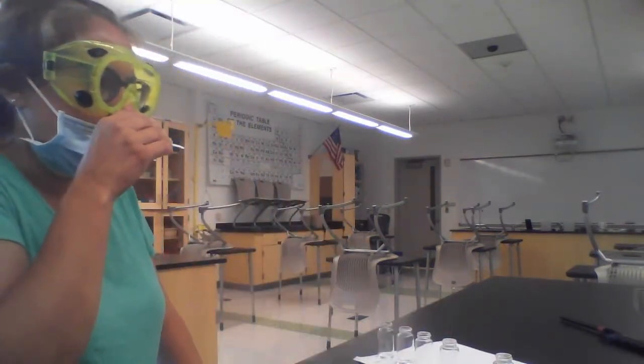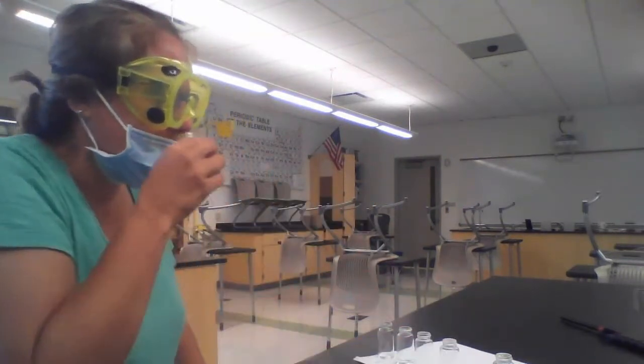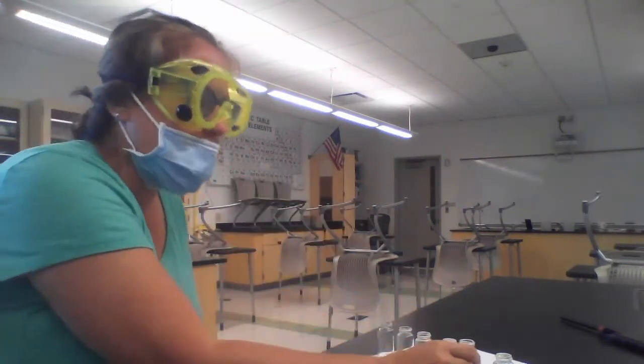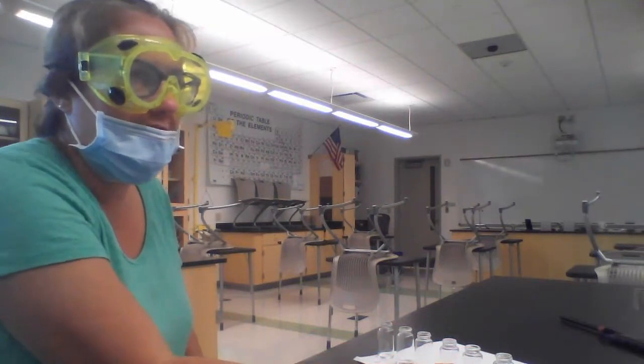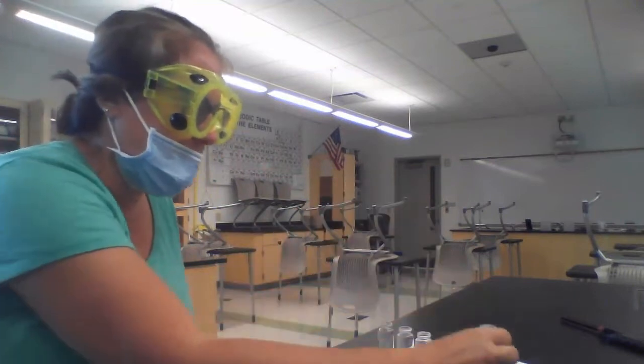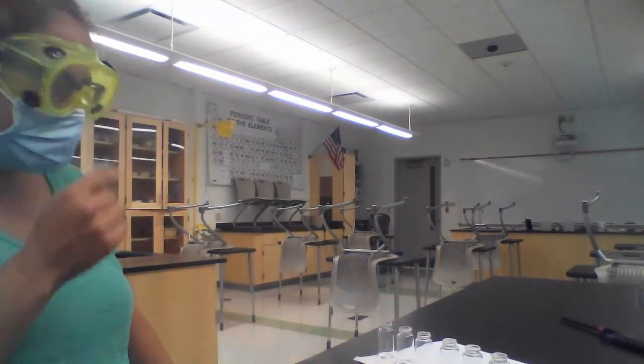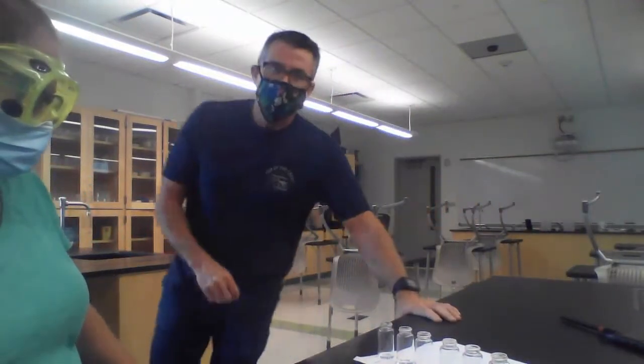Ooh. This one has a less strong smell. Very, very faint, if any. Very faint. And the last one doesn't have any smell to me at all. Number 6 has no smell at all. All right, so that's the appearance and the odor of each one.